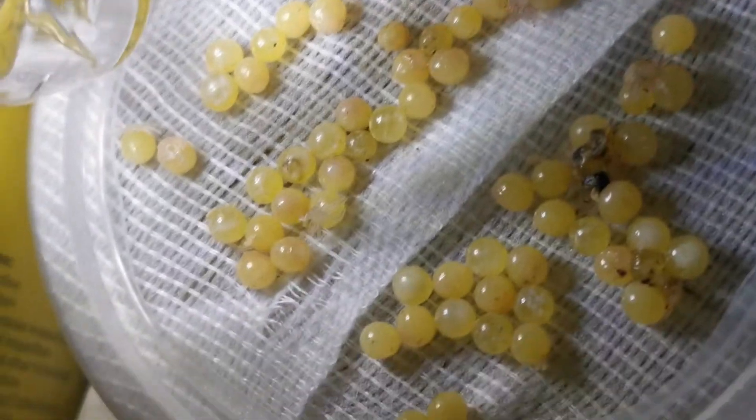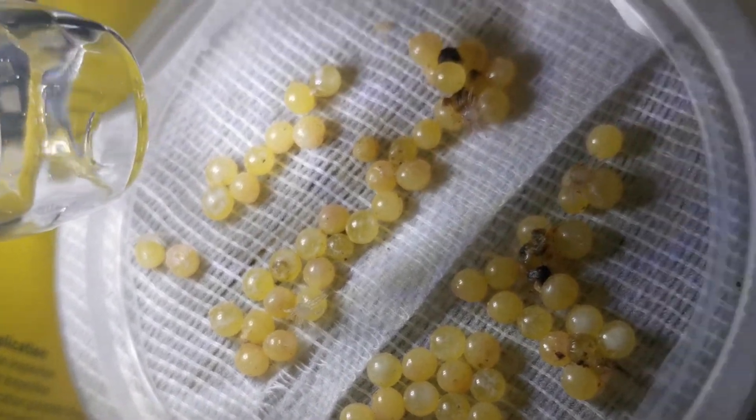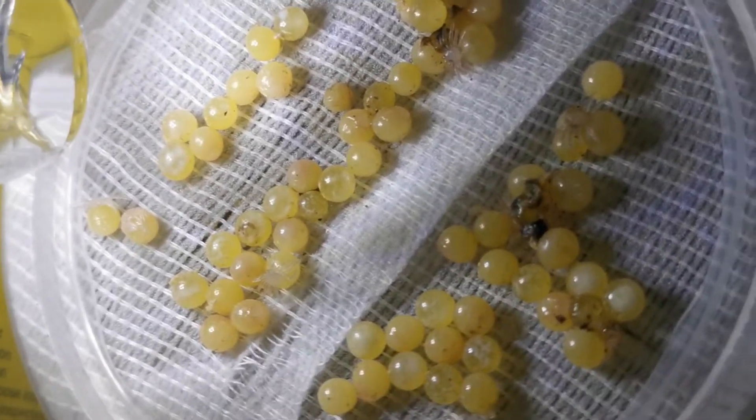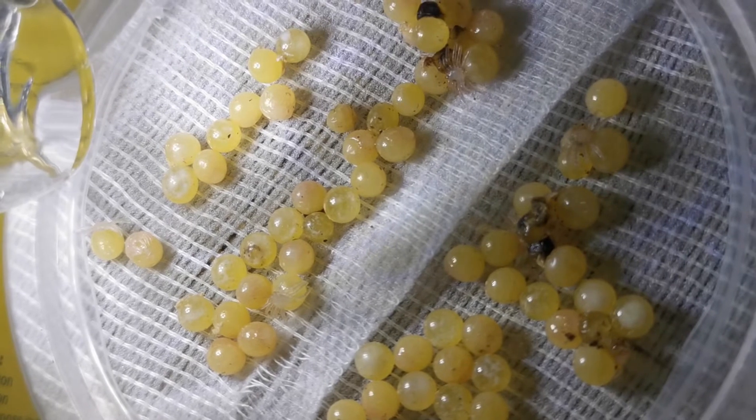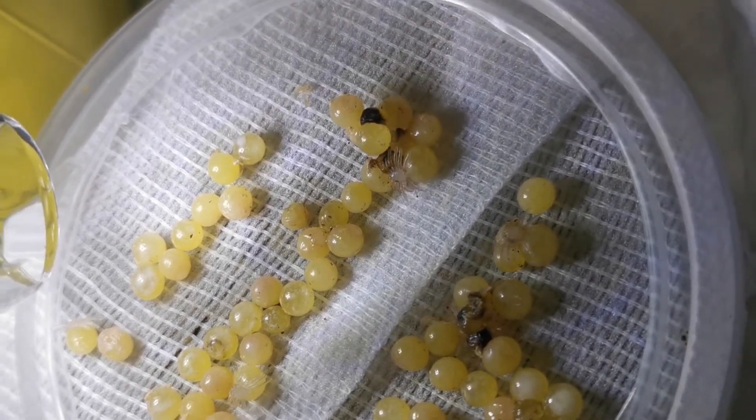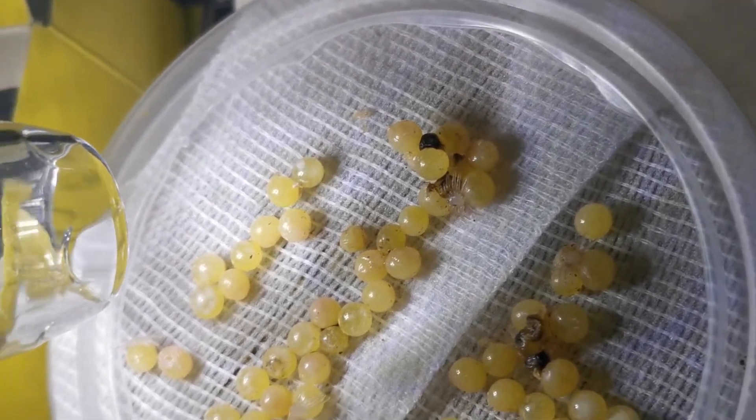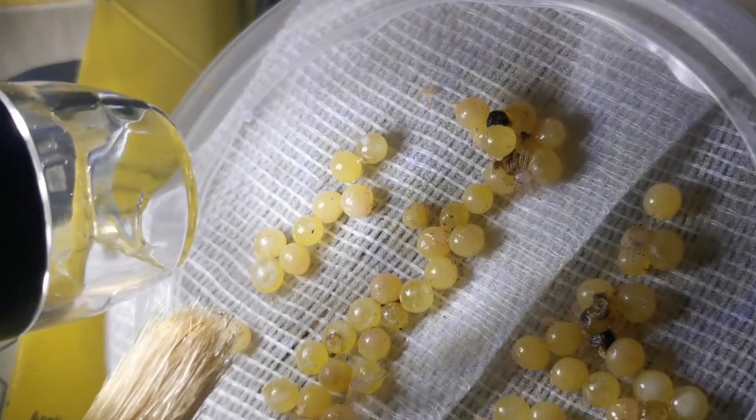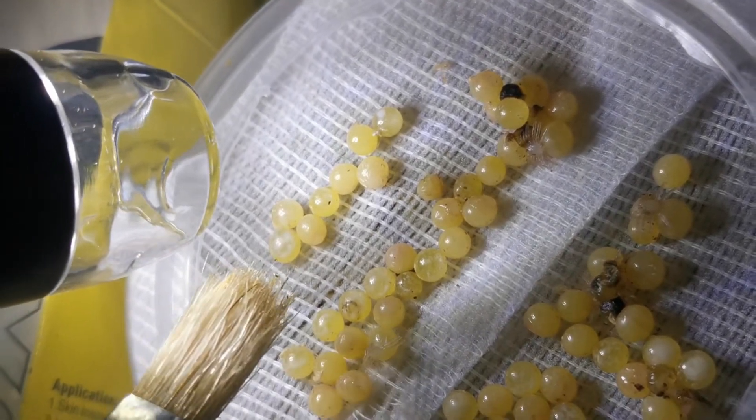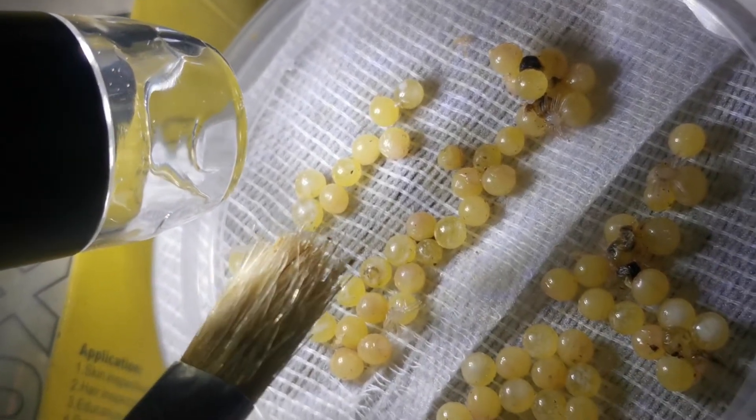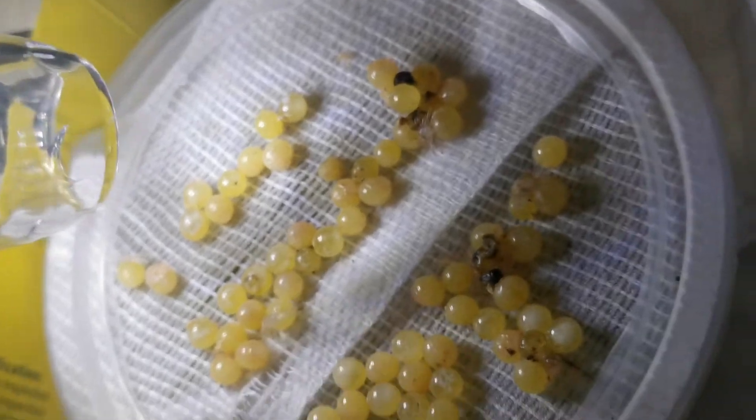There's one or two that I can take out that I can see, which is pretty awesome. But I actually wanted to just show you guys the eggs itself. You can see the white liquid right there. You might think it's bad, but it's not, it's actually very good.